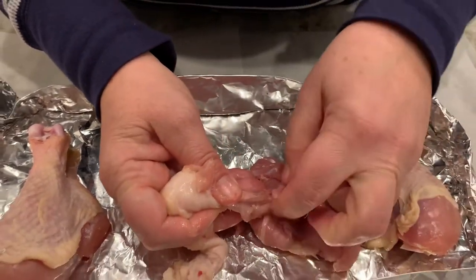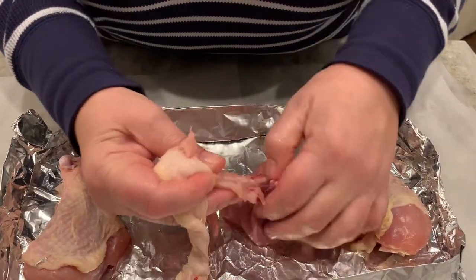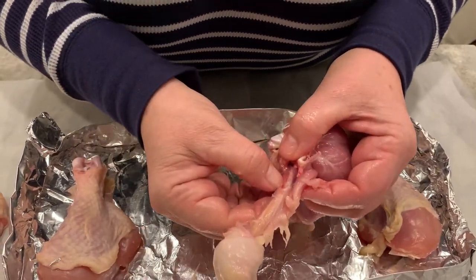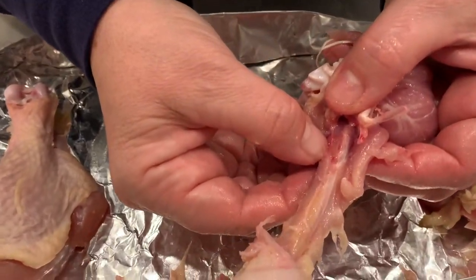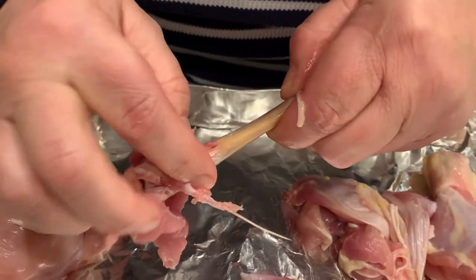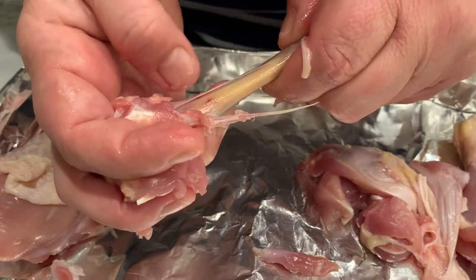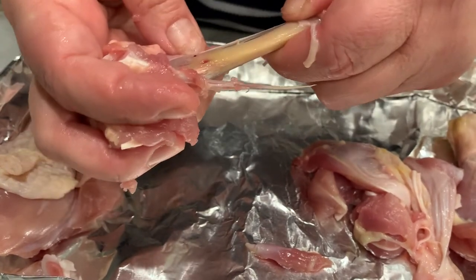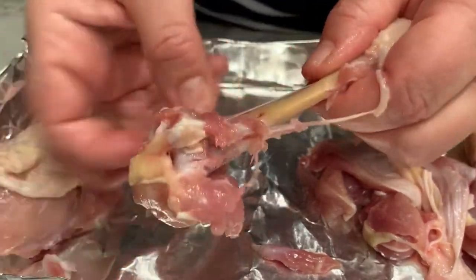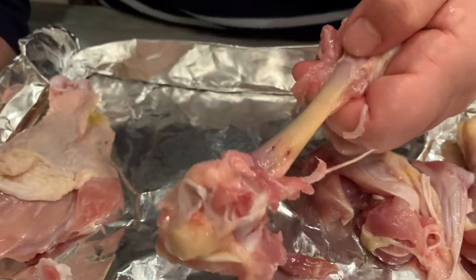Even though bone is connective tissue and a very thick tissue, it's still alive and needs blood flow. You can see that hole — that's where the blood vessel enters. That's how bones get their blood supply, and also how the produced red and white blood cells exit, via a vein and an artery running into the bones.